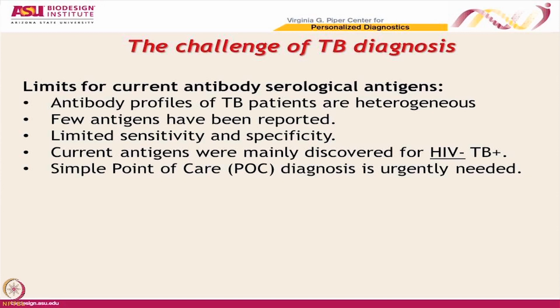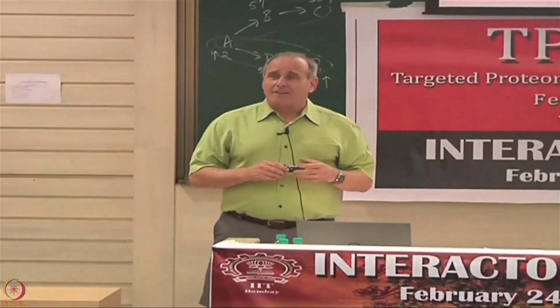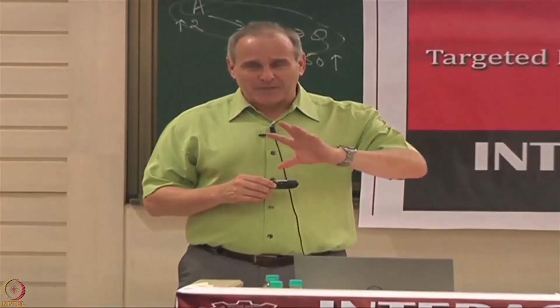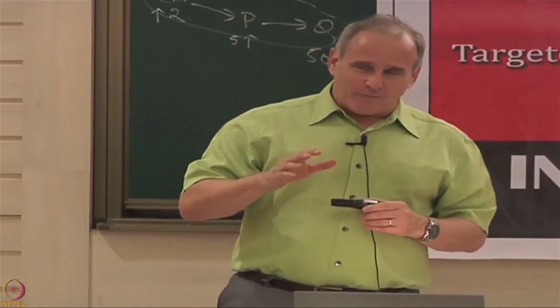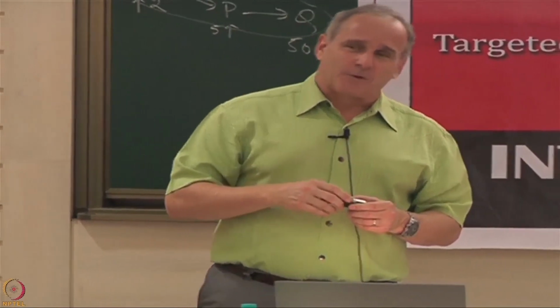So we had done a study together on a funded grant to look at the whole TB proteome, screened with serum and all that. And for a variety of complicated reasons, that particular study could not be used. There were some issues with mixed up spots on the array. Normally we don't do this, but this was one case where it was a problem.